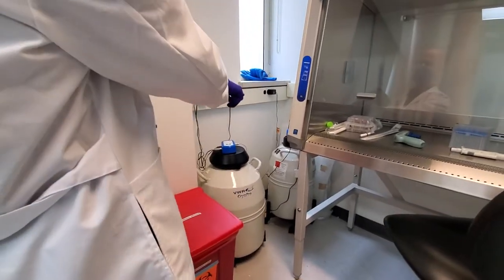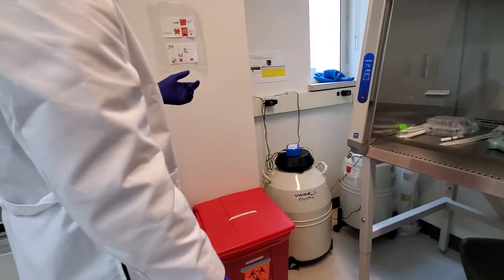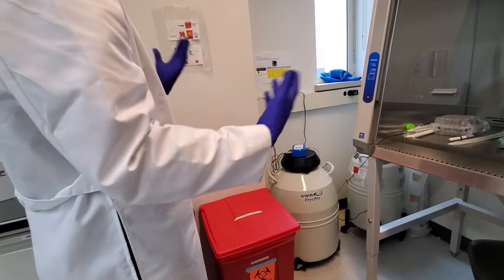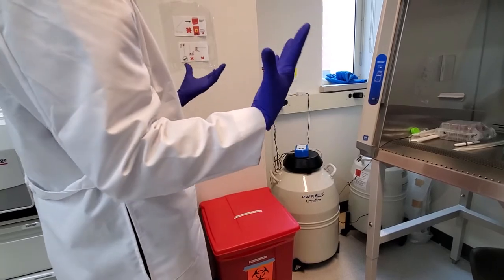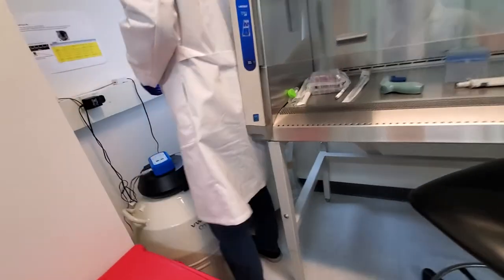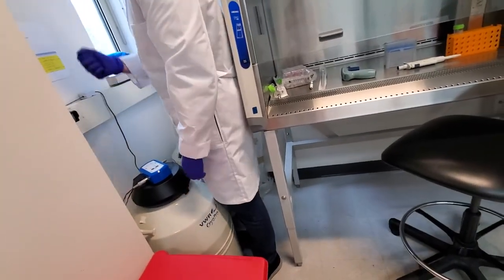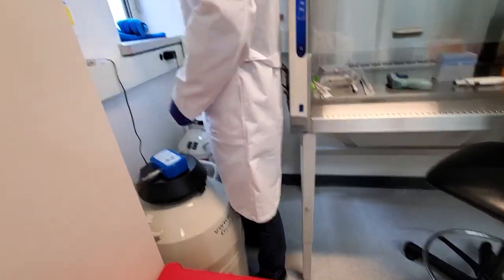So over here are our cryo containers. I'm going to go with the little one back there. We have gloves there if you need extended time touching things or handling things. I'm going to go pretty quickly, so I'm just going to go in and grab what I need. They also don't really fit very well over the gloves, so I'm going to try not to use them. A lot of times it's hard to move it out, or things fall off or in there and they get in the way of the things going back in, so we'll see how this goes.